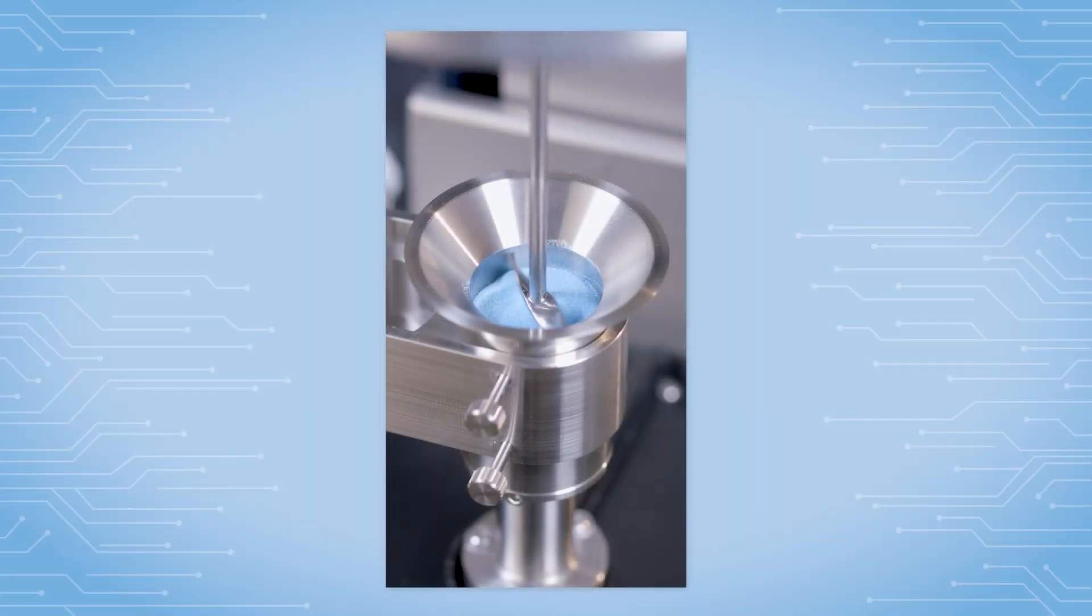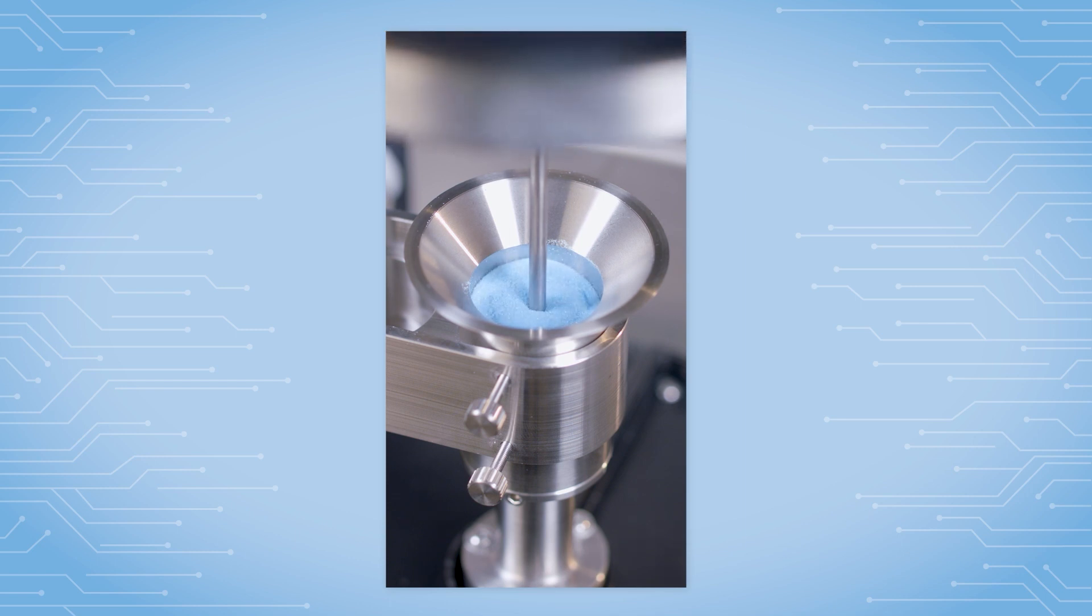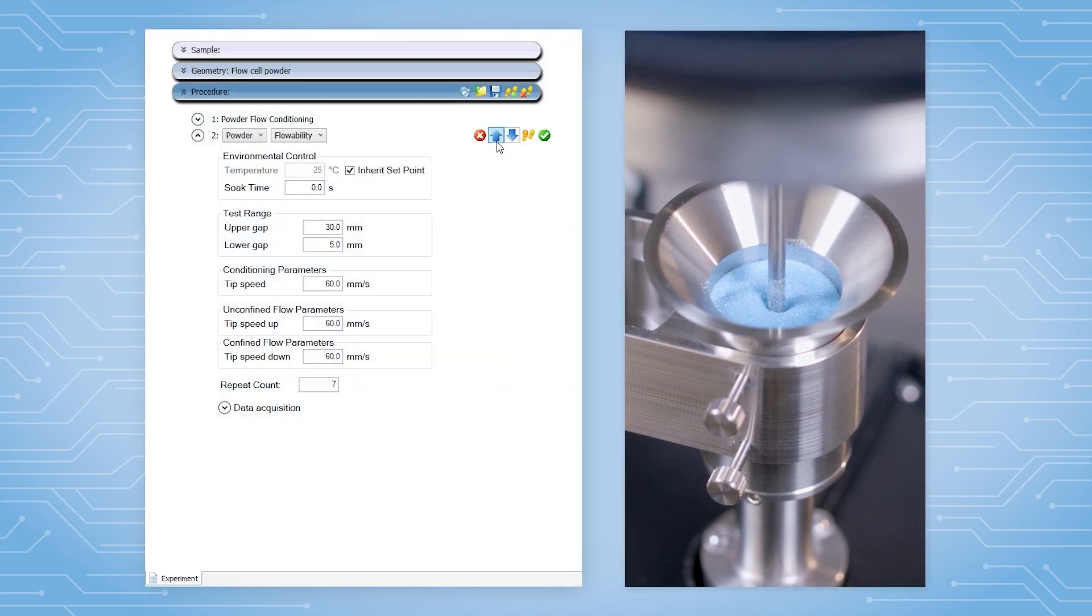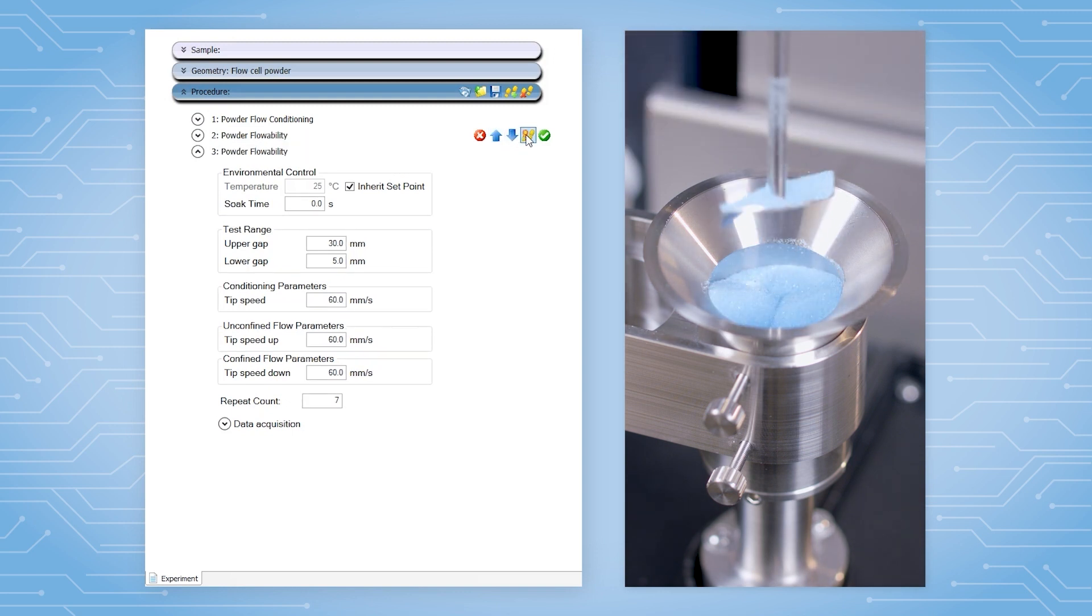The powder flow ability step performs measurements of both unconfined flow, raising the rotor upwards through the powder, and confined flow, driving the rotor down into the powder with a conditioning step between measurements. Multiple repeats of the sequence are typically used to evaluate powder stability.